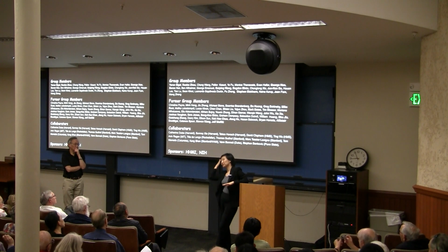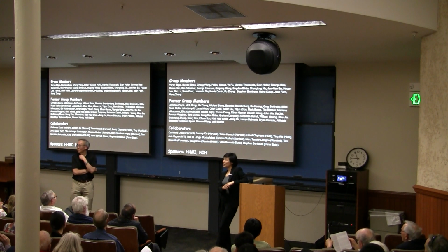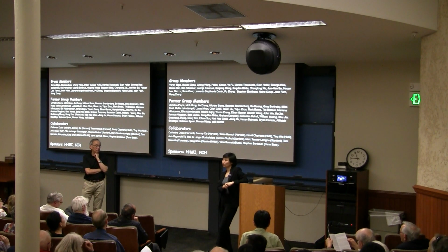For example, for aberration, you could actually use adaptive optics to solve problems enough so that a few hundred microns could be imaged. Maybe 1 millimeter is already enough to get scattering. Yeah, millimeter is really bad. Yeah, so at that depth, scattering becomes a major problem. And I mean, there are ways, but as I said, a lot of improvement is needed in order to battle the scattering problem.